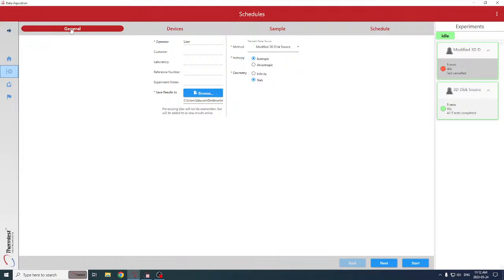Now the MPV has 1 channel, so you're plugging in 1 sensor at a time, which allows you to run at room temperature or automate it with temperature depending on your accessories. And it still has all the capability of the same MP1 software, just lacking some of the scheduling capability because of the multi-port channel on the MP1.